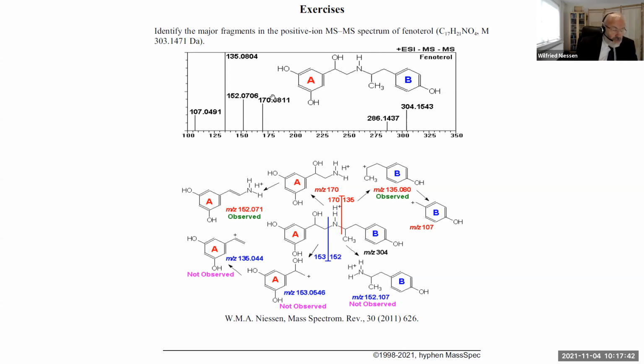Sorry, if I may, just a small question. Can you hear me? Yeah, I can hear you. So you say about the accuracy. You say it's about if it's calibrated right until the first decimal, right? No, in the third decimal. Yeah, the third. But the problem when we do metabolomics, when we have thousands of compounds, we never achieve it. Maybe we do when you have a very small number of molecules, but when we get really untargeted, we get it to the second decimal normally at maximum.